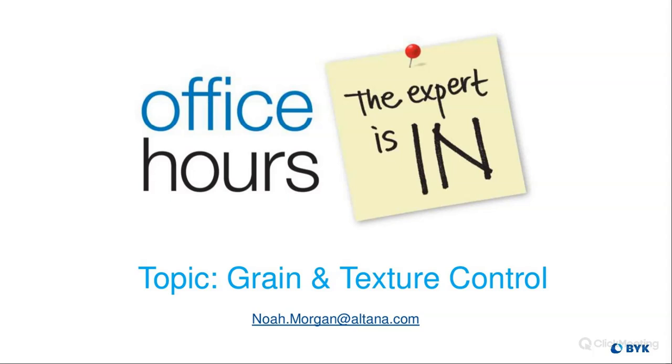I'd really be interested in seeing, maybe we can share the samples and talk offline and find the best way to measure those types of specific samples for you. I've got a couple different colors, but mostly the shades we use have quite low gloss levels, less than 5 on the gloss 60 scale. But interesting piece of equipment, though.